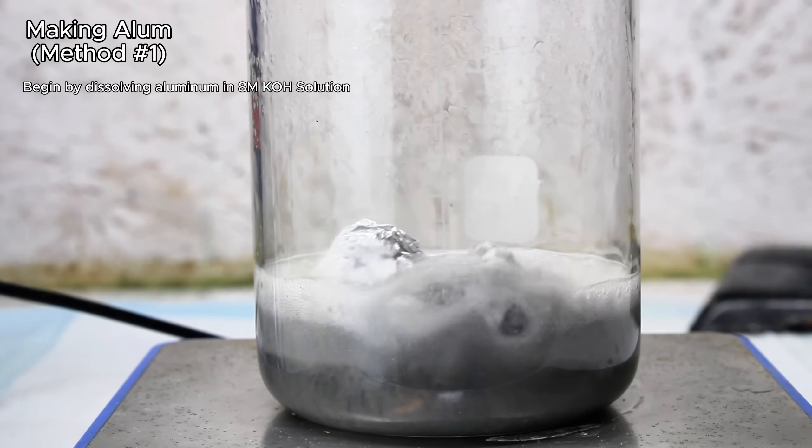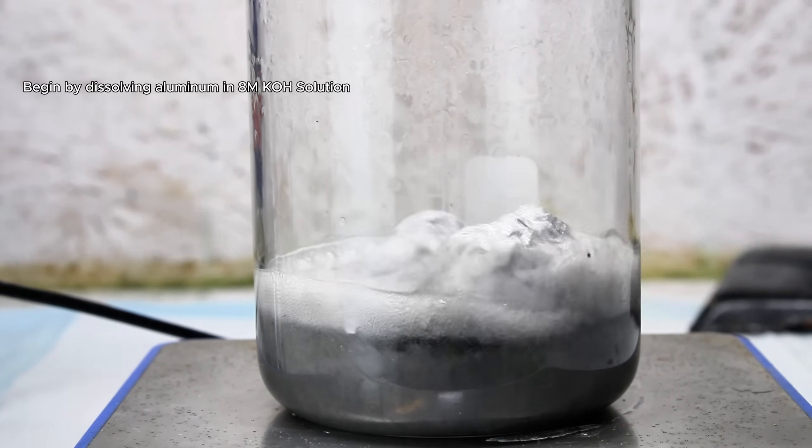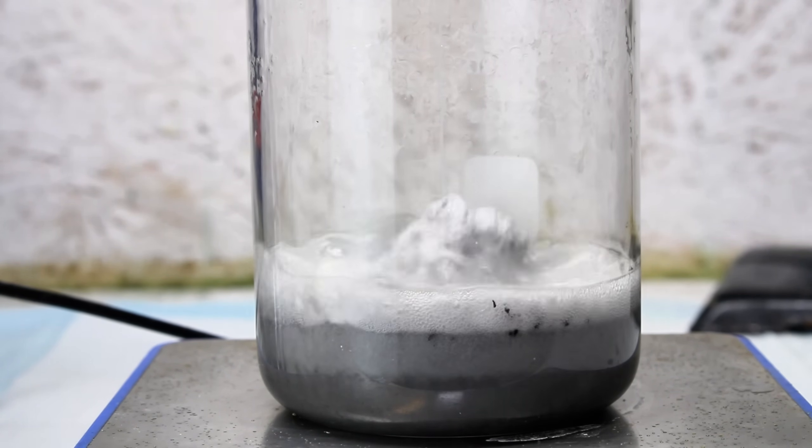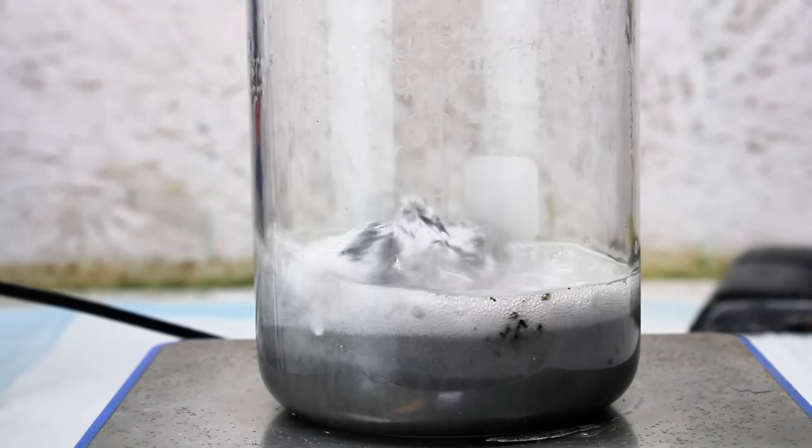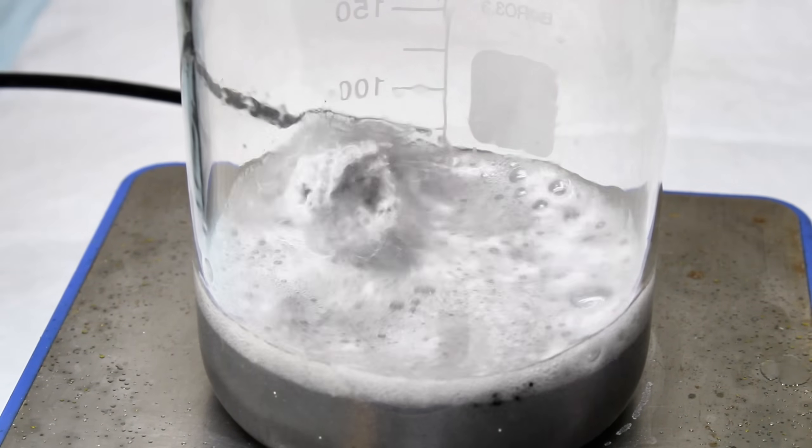Anyway, to get started making alum, I needed to dissolve some aluminum metal in a concentrated solution of potassium hydroxide. And my source of aluminum here is simply aluminum foil. And potassium hydroxide is typically sold as caustic potash by soap making suppliers.